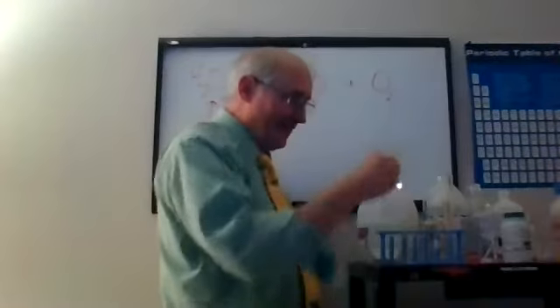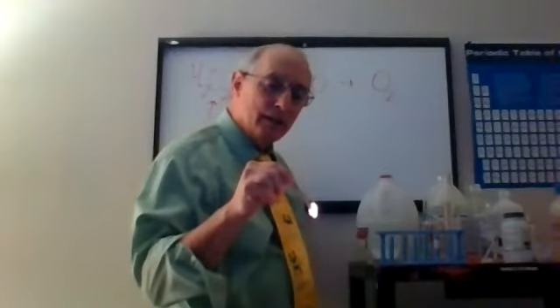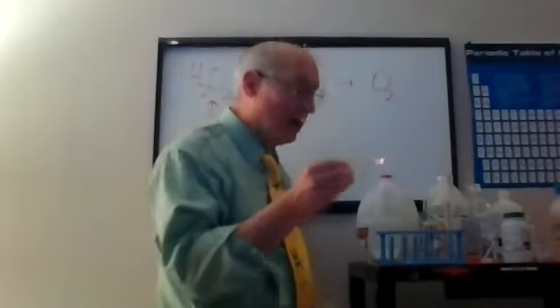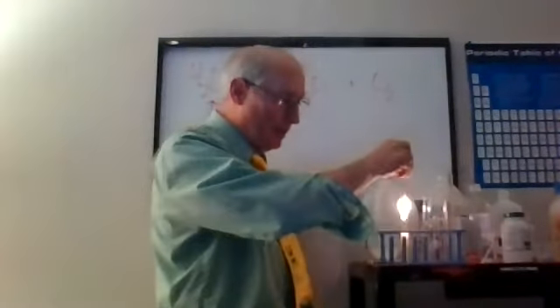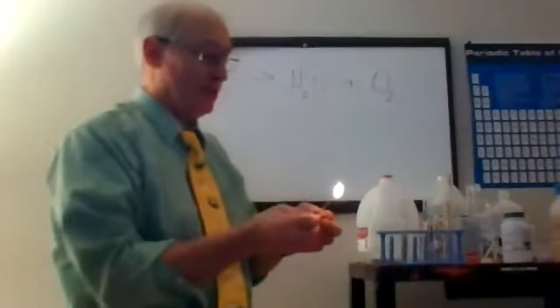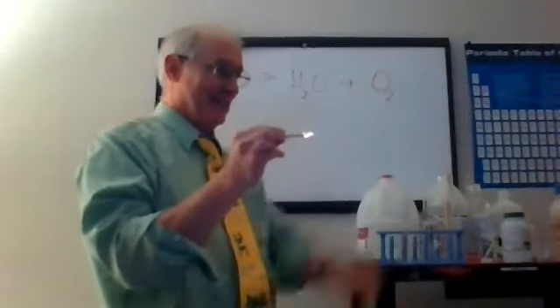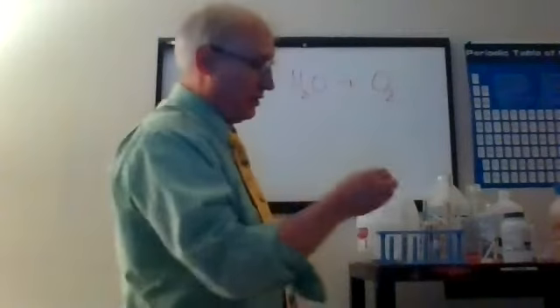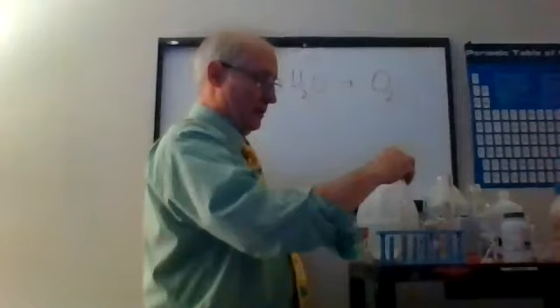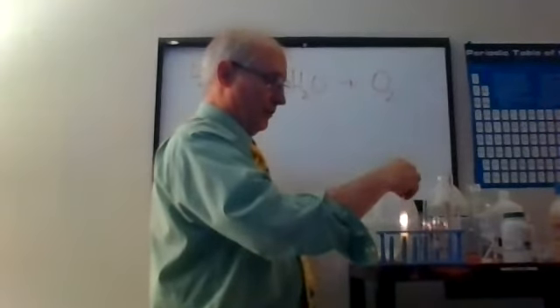Okay, here we go. Ooh, isn't that neat? Let's go ahead and get a little glowing ember there again. And after we get a glowing ember, we're going to blow it out. We'll stick it in the oxygen that we're making. Pops right back into a flame. Here, if you get those glasses on, you can do it once. Just see what you think of that. Have to be quick. Get those glasses on. Okay. So you've seen this. Now let's keep it as a flame. If you keep it as a flame and you put it up here, it will glow even brighter.